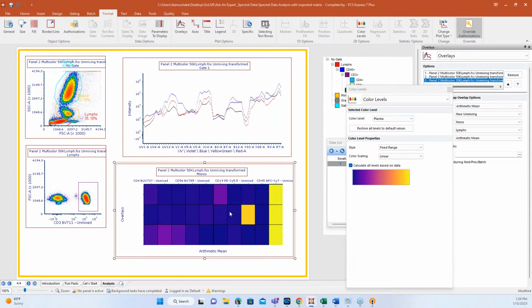Yep, and you can do these overlays with different data files too if you wanted to. So here Robin just did the same data file with different gates, which is one perfectly good way to do it. But if you have a treated and an untreated file and you want to see something that's elevated or positive in one file versus the other, then you could add different overlays of different data files and do it that way as well. Yep, there's always a ton of options.